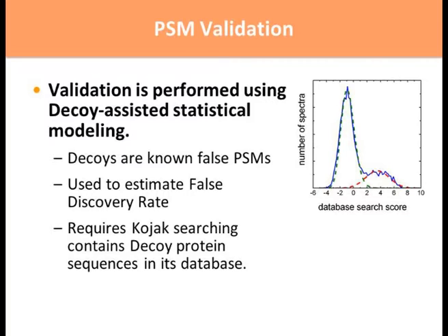The way that this is done is simply by providing decoy proteins in your cross-linked search database for the algorithm. So any sort of cross-link that is to a decoy peptide is a false peptide spectrum match. We can model the distribution of the decoy matches to the remainder of the PSMs, and then apply statistics and find an appropriate FDR cutoff.